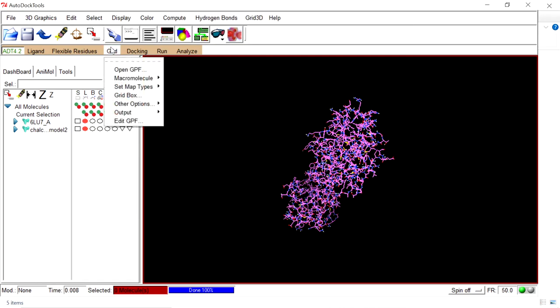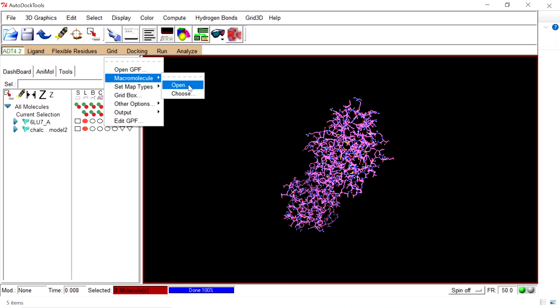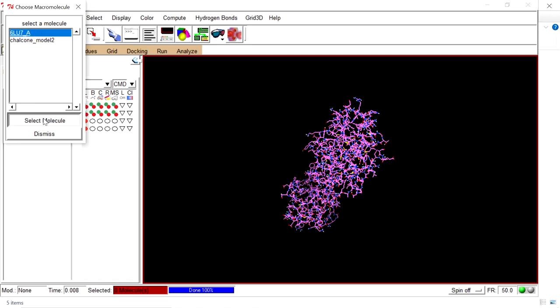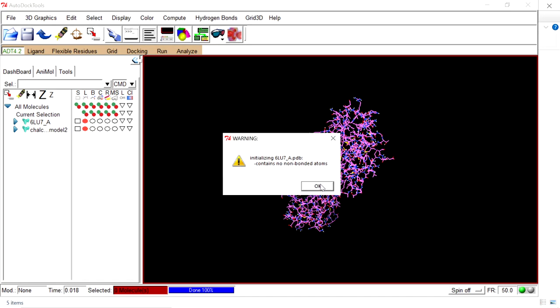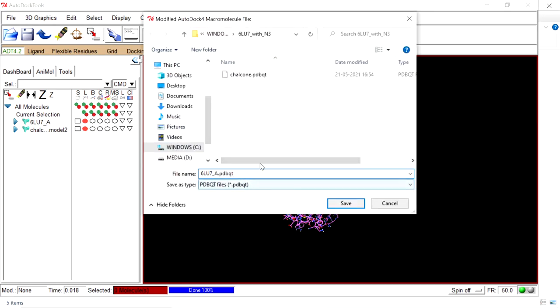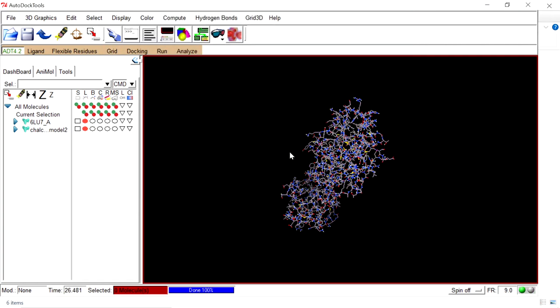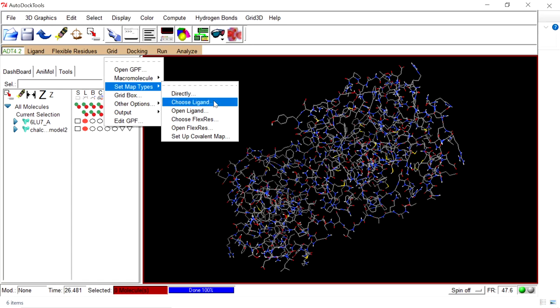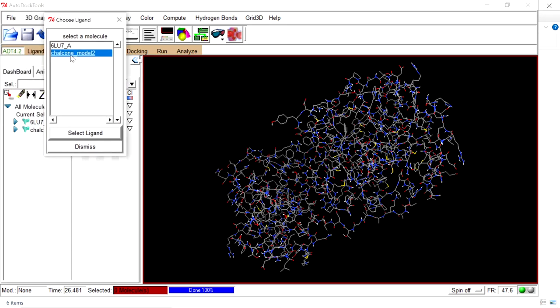After that, we are going to create the grid file. Go to Grid, Macromolecule, and Choose. The macromolecule is already present, so choose it. This is the macromolecule — the protein file. Save this macromolecule as PDBQT format. After saving, the color will change. Next, go to Grid, Set Map Types, and choose the ligand. The ligand is already present, so select it.